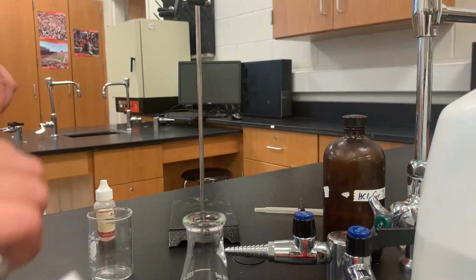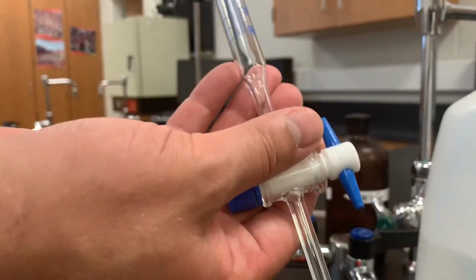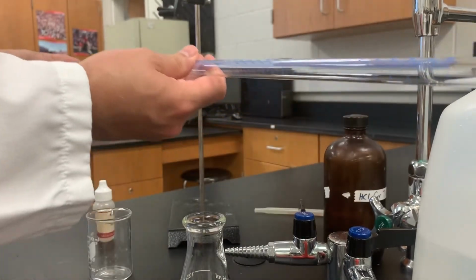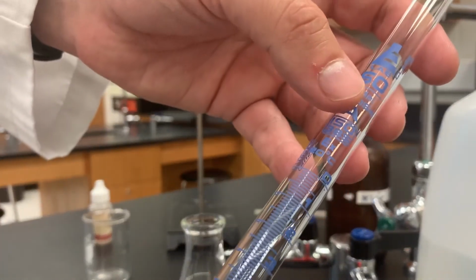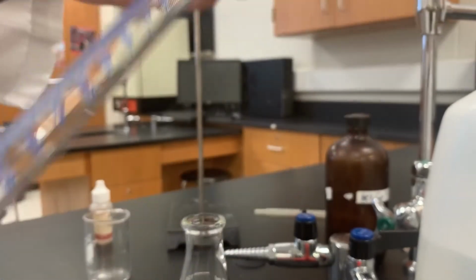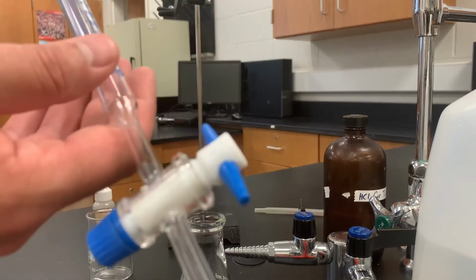Then the next step is I'm going to use this device called a burette, which looks like this. It's got several different parts to it. This long part is called the column, and it's numbered from 50 down here at the bottom all the way up to 0 milliliters up here at the top. And so when you fill this burette up, it keeps track of the volume that you use.